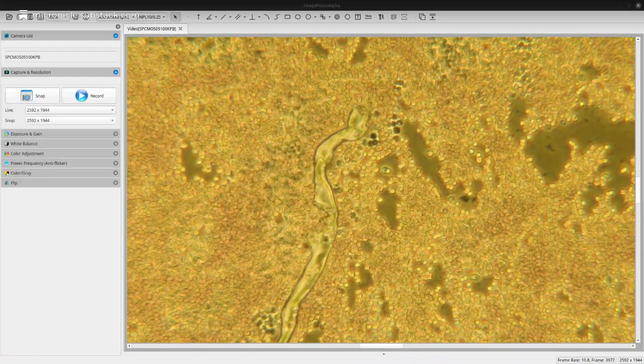I suppose it's normal to see some fungal growth coming in, even though blood is supposed to be sterile. I'm sure someone will say, well, you've got a mold spore in there somehow in the process, which of course is possible.